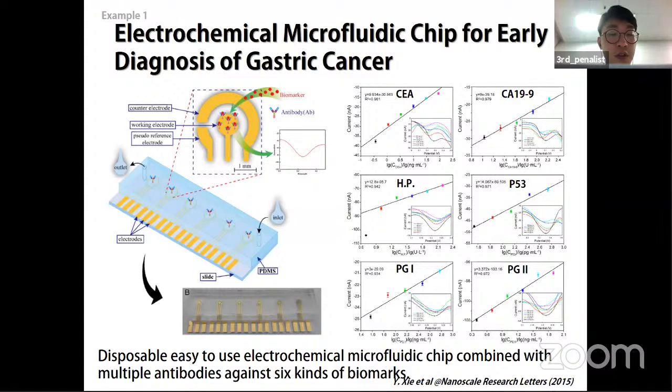This method showed better sensitivity compared with enzyme-linked immunoassay, with results on 394 specimens of gastric cancer sera. This paper shows the theoretical evaluation and real-time dynamic monitoring of the progress of gastric cancer in the near field.